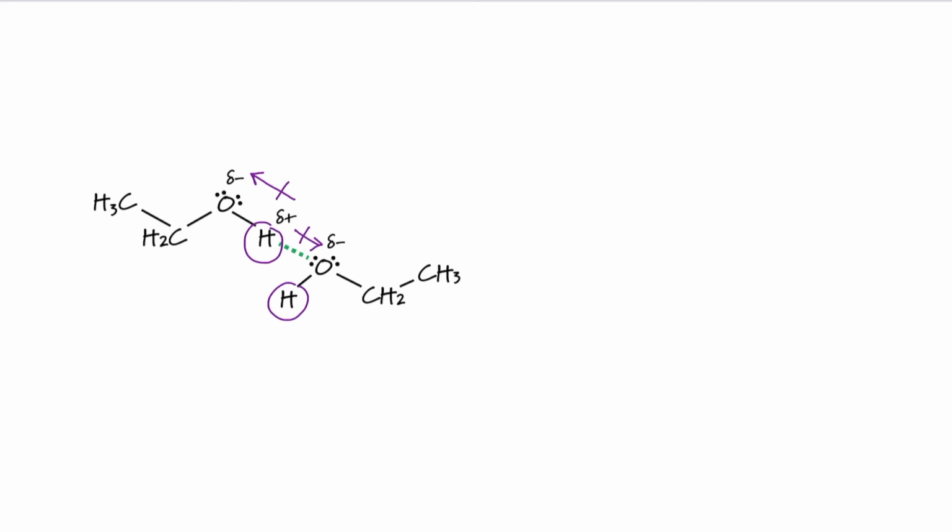And hydrogen bonds are transient. They're coming and going. They're being formed. They're being broken. So we see the chemical shift for these particular protons being variable. Hence the peak turning up anywhere and it being broad, not nice and sharp.